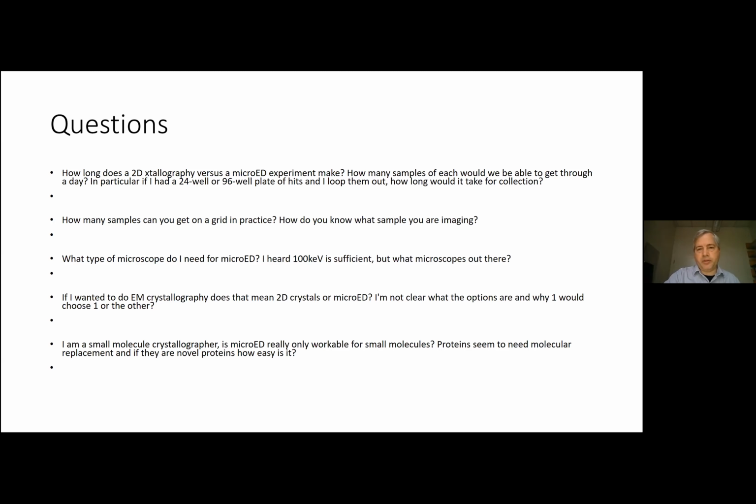How many samples in a day, it's hard to say. You might be able to get through a dozen grids in a day if you look and don't really collect too much, or more, depending on how fast you go through and how easy the crystals are to find. You would have to at least do an atlas of the grid to have an idea whether you see crystals or not. And then you would do diffraction patterns of a few of them just to see if they're diffracting.